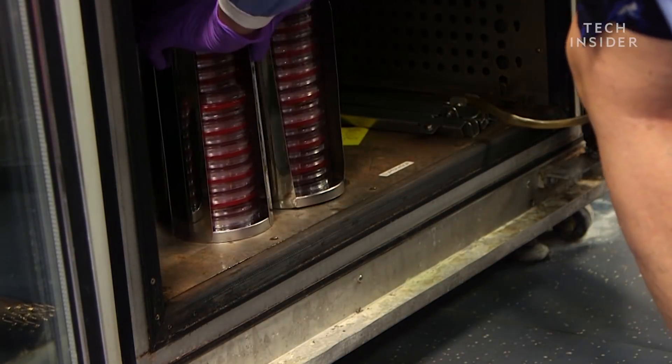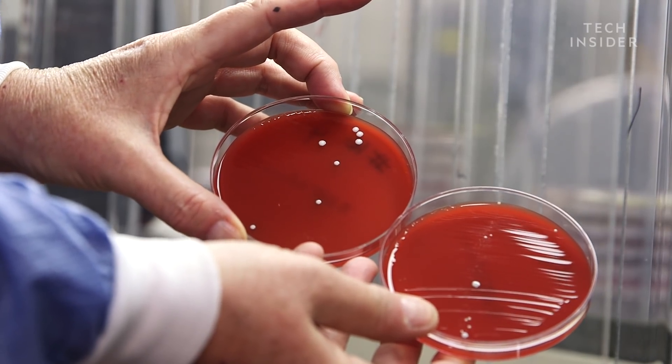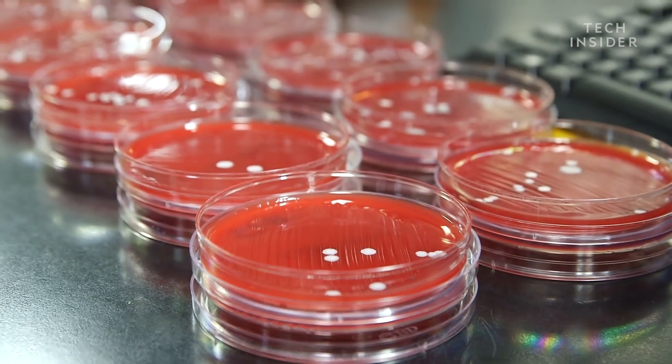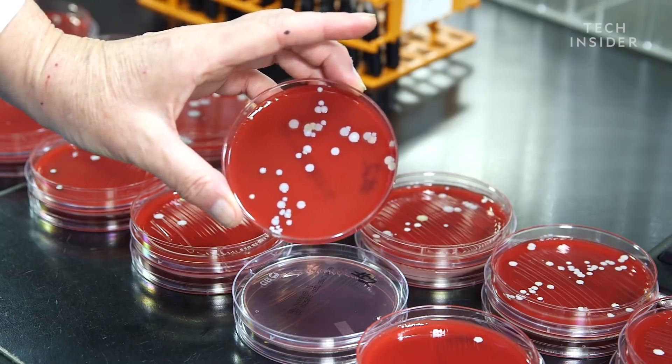We let the earbud samples incubate for about three days and then went back to the lab to check out the results. Two samples were positive for yeast, and one was positive for bacillus — something we'd find in soil. I was really shocked we didn't find anything super gross or super dirty. Most of what we recovered was coagulase-negative staphylococcus — the predominant organism we have on our skin. The theory that ear canals may have something a little different didn't really pan out; we got organisms as if you had swabbed your arm.